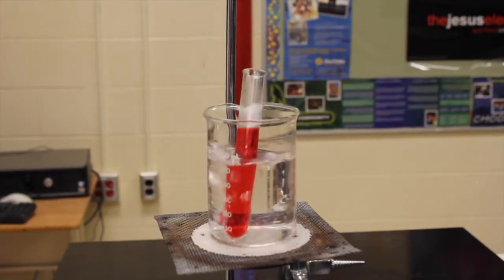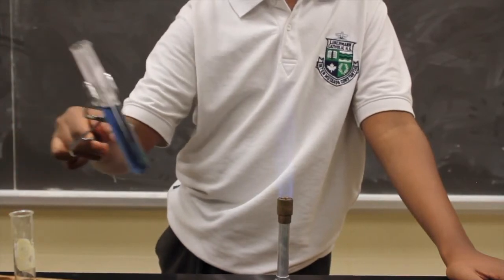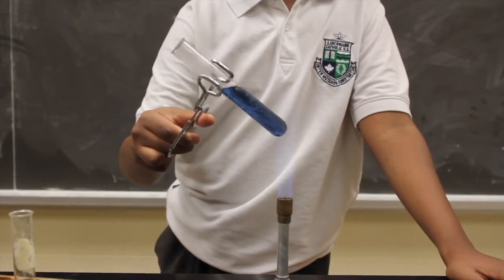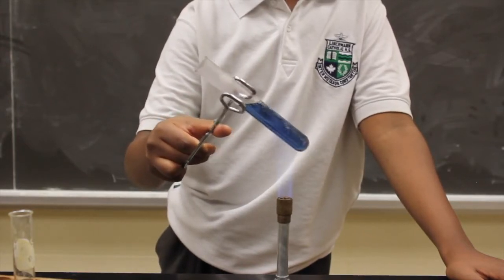However, the test tube could also be heated directly with the Bunsen burner. Hold the test tube on an angle away from yourself and others. Move it back and forth to heat it up evenly.